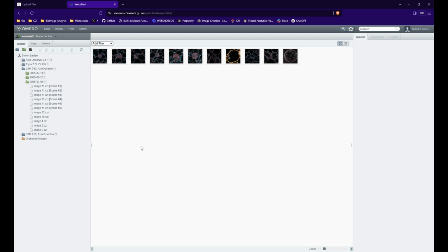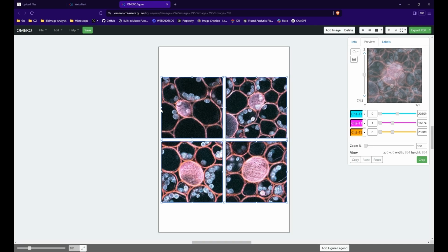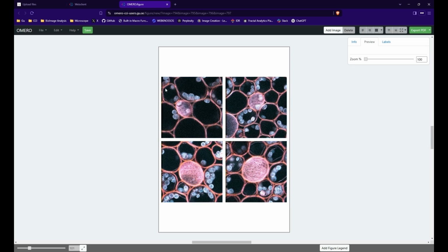Hello everyone, today I want to make a very quick presentation about the Omero figure. So for that I will select 4 images, and by clicking here I can open them with Omero figure. Omero figure will automatically add them in a panel that is an A4 right now.